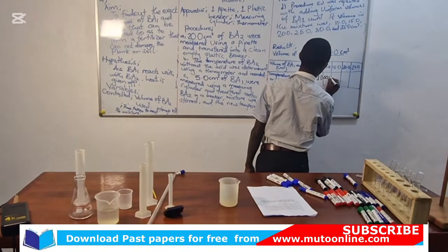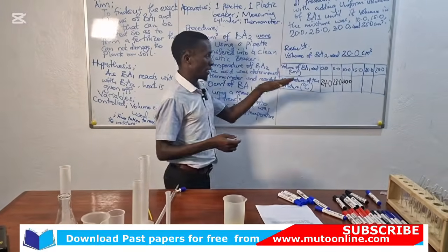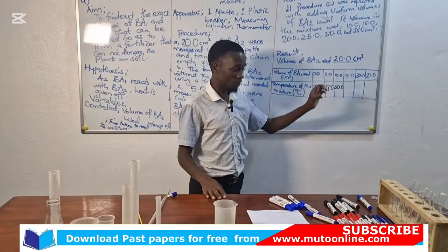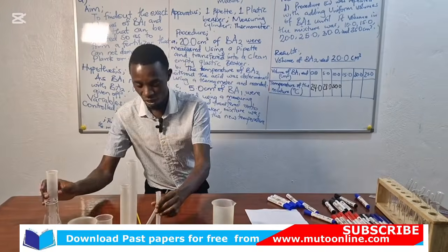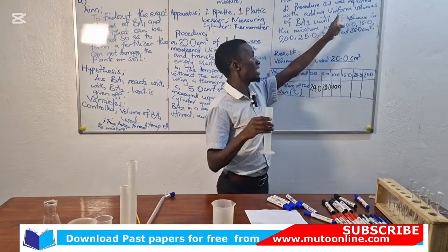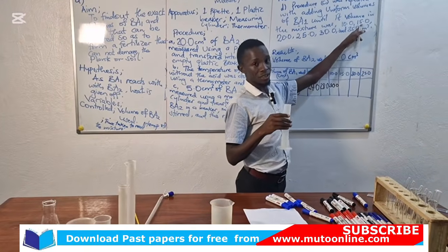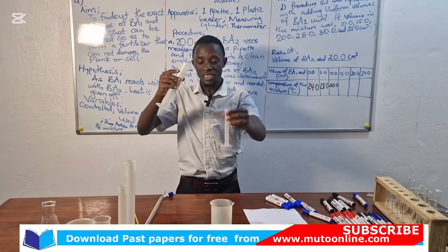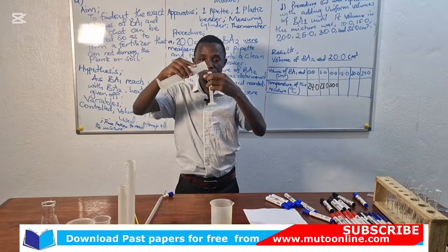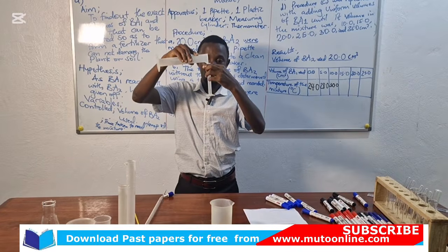When we made 10 of the acid added, we are going to add more 5. Repeating the procedure, we are going to add the uniform volume we added previously, that is 5, to make it 15. We are using the same solution of BA2. So we are adding BA1 uniform volume, that is 5.